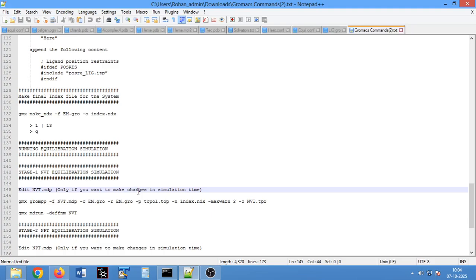And if you keep the names as I have shown over here, you can virtually use it for any protein-ligand system, so far as it contains the parameters and topologies of your ligand properly, right? So this is quite a robust protocol that we have designed. I appreciate that it will be beneficial for you if you just keep the nomenclature that we have been using, right? You can use it for any system.